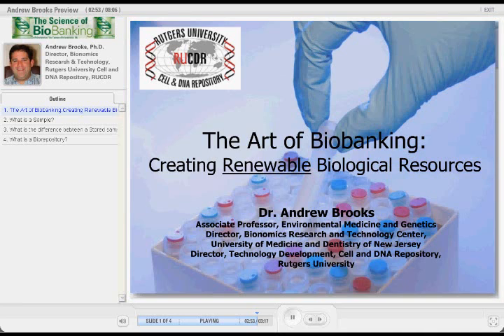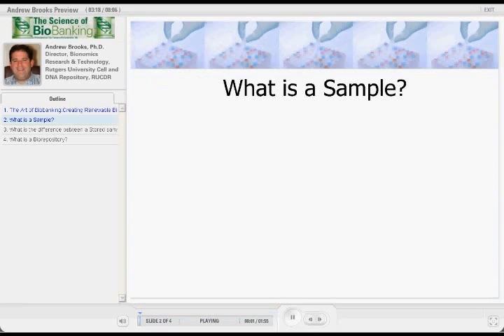So with that said, the first hour or the first half of the course here is going to focus on how you develop a protocol or how you develop a process for creating a renewable resource. And the focus here is on renewable biological resources, at least from my perspective for the RUCDR, which is the Rutgers University Cell and DNA Repository. That's what we do. And I'm going to define, from my perspective, what a sample is, what a biobank is, and what a renewable resource is, and then go through some protocol development from there.